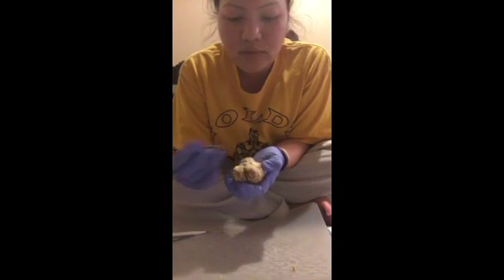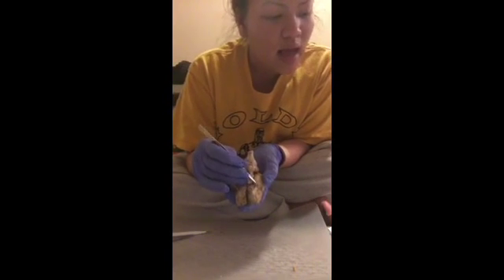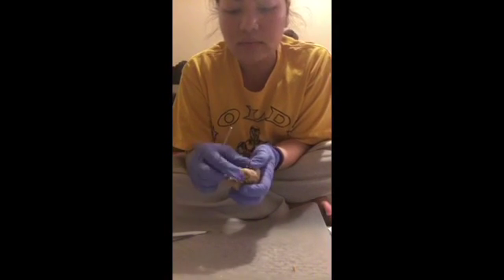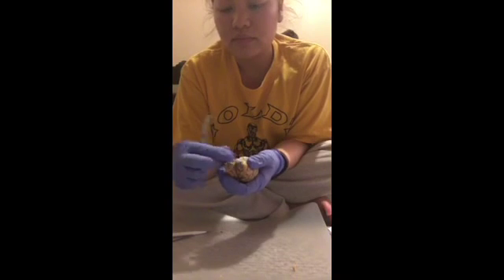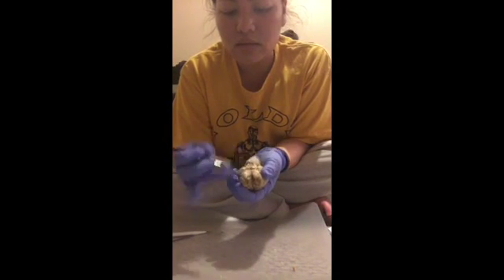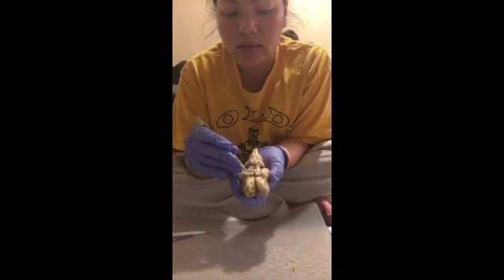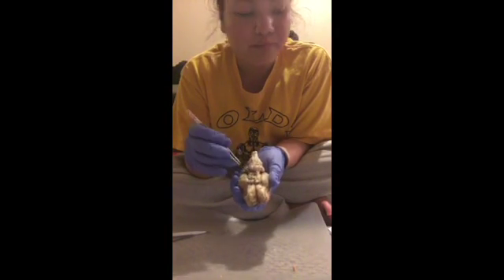Optic nerves are somewhere around here. Optic nerves, and the optic chiasm is actually right here. Right here, that's the optic chiasm right there.